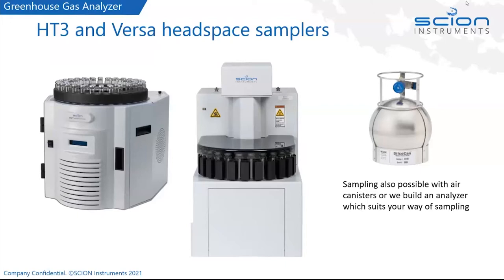If we look at the analytical parameters, there are three columns installed in the GC.